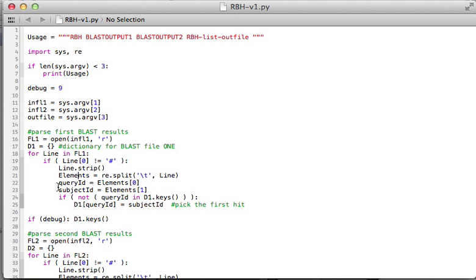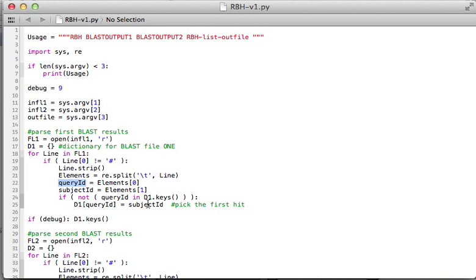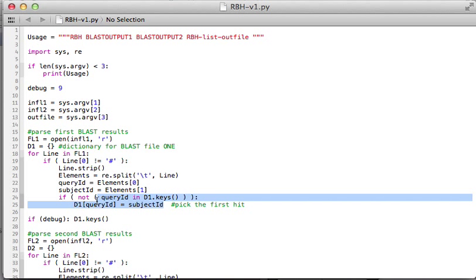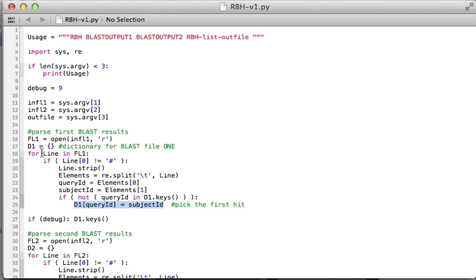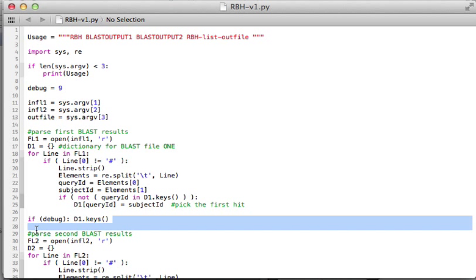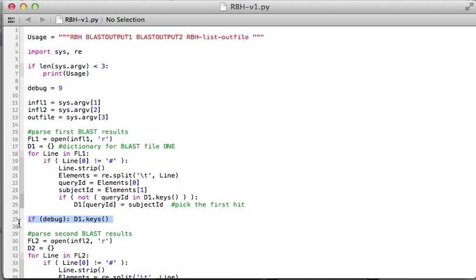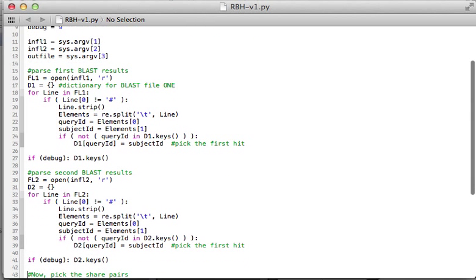The first one is a query ID, the second one is a subject ID. It's kind of confusing what is subject, what is query. I find out the first one hit the second one, that's basically it. If the first ID is not in the keys of my dictionary, then I will add this new hit into the dictionary. Basically, I'm picking the first hits. If it's in interactive mode, you can also print it down to see whether the key is correct or not.